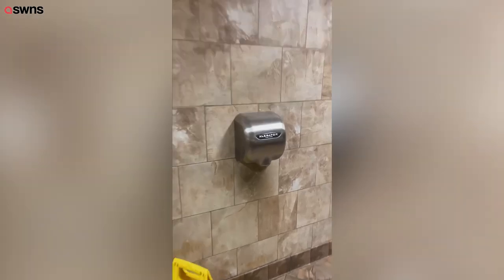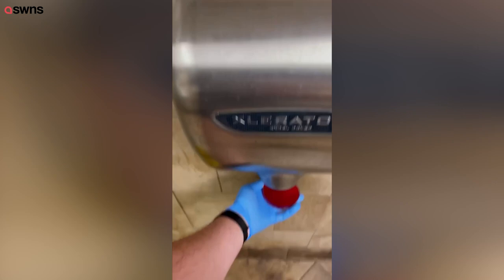We're heading back to hand air dryers for this episode of 'How Germy Is It?' After seeing the results from the last time, I wanted to do this experiment again and add a control to simulate shaking my hands dry.